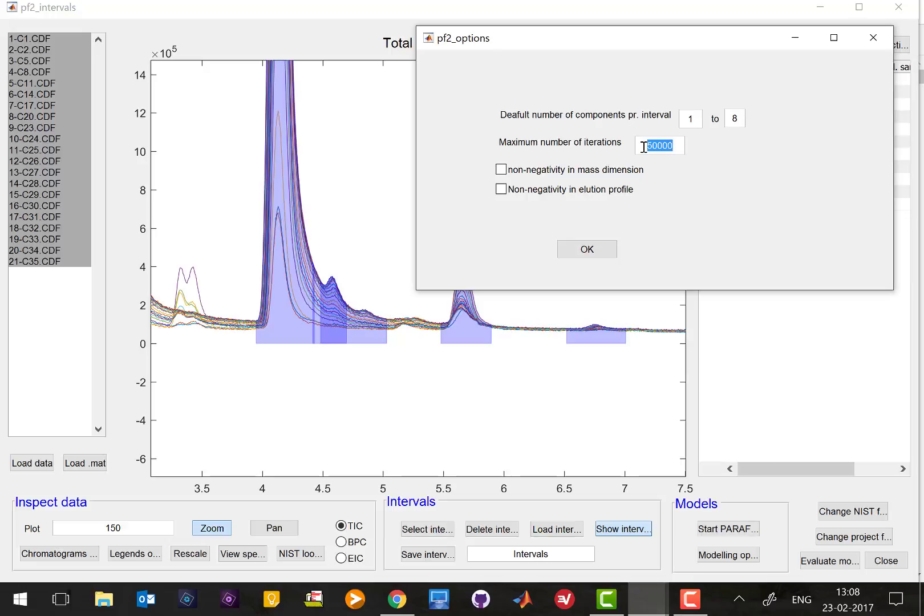We don't worry about the number of iterations in the algorithm we just leave it but what we do want is that we want to have non-negativity in the mass dimension.